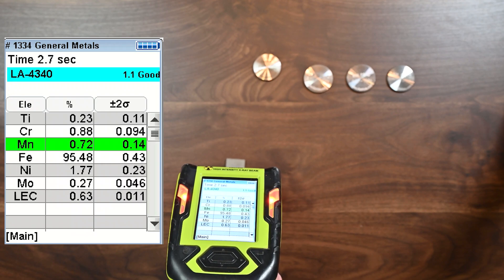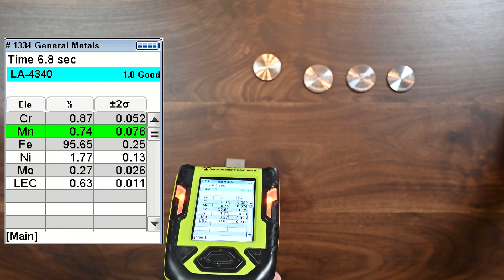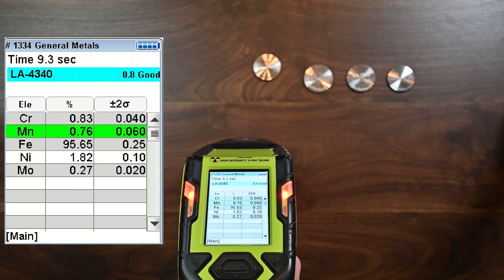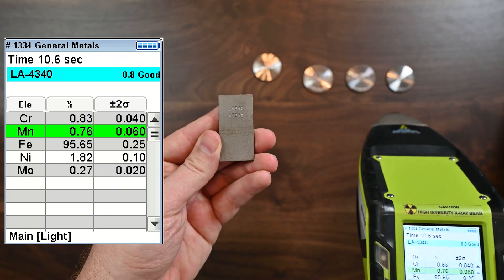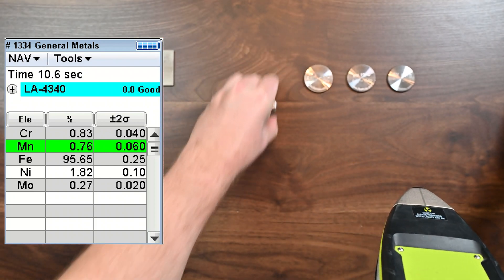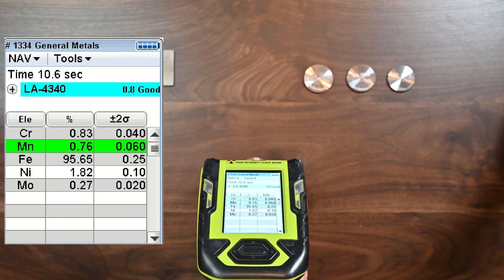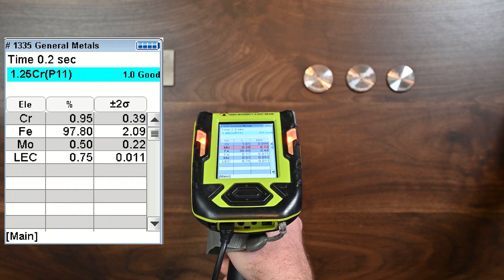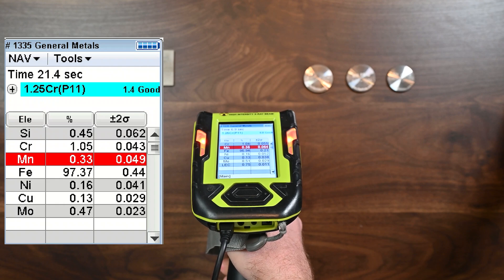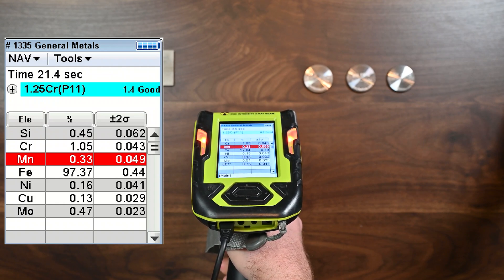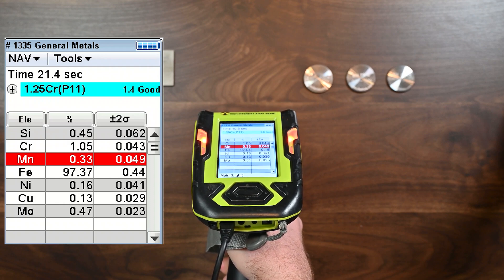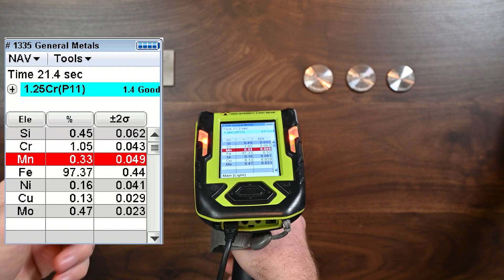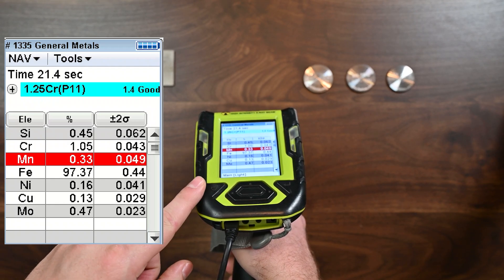Now you'll be able to see here, my silicon is going to be a little bit high. That's expected for some of these samples have been peened or shot peened with or blasted with silicon media. And you actually can see that with XRF sometimes. So we're going to keep going here. This is that 4340. And what you'll see here, you can see the chrome, manganese, the nickel. But let's stop the test there. I mean, there's really no point in testing more, right? So basically here, we've got that 4340, pretty easy to see. So if you're working with these kind of alloys, you can see that a handheld XRF just like this one is going to do a great job in nailing even your low alloy steels, especially if you're just looking for that alloy identification. You're talking one second analysis. I mean, lightning fast. The calibration for this unit seems spot on. And Niton is known for really good and robust calibrations, and that's definitely evident in this analyzer here.